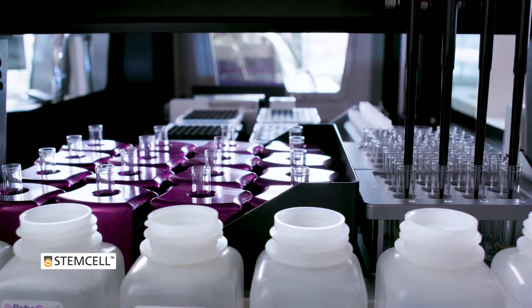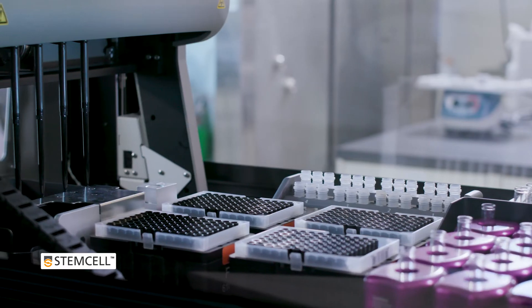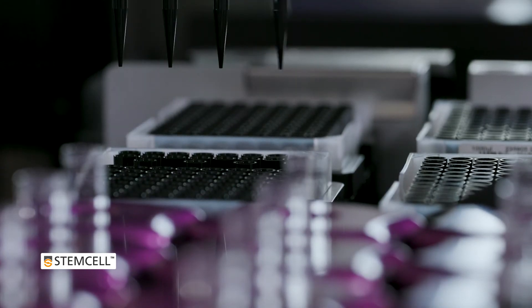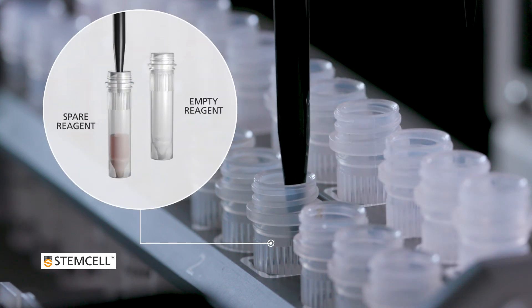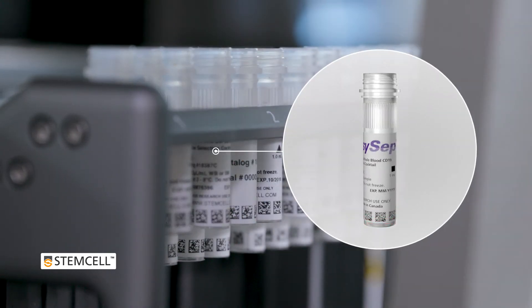To eliminate sample cross-contamination, the instrument uses a column-free cell isolation system of 16 individual magnets and disposable liquid-sensing tips. These liquid-sensing tips automatically detect reagent levels to utilize spare reagents when required, and an integrated barcode scanner ensures that all samples and reagents are tracked and recorded.